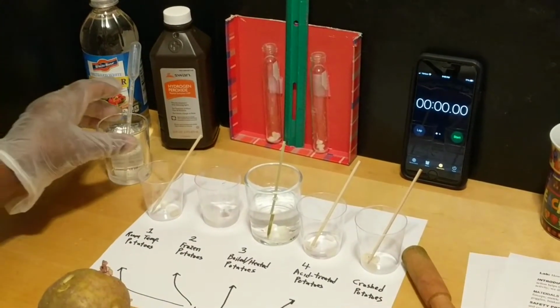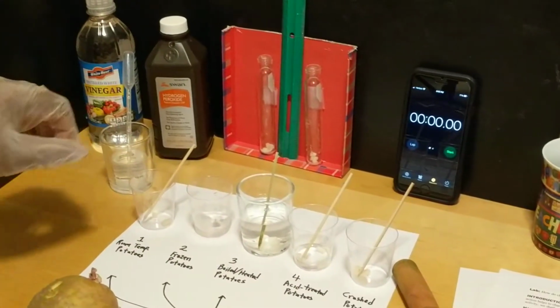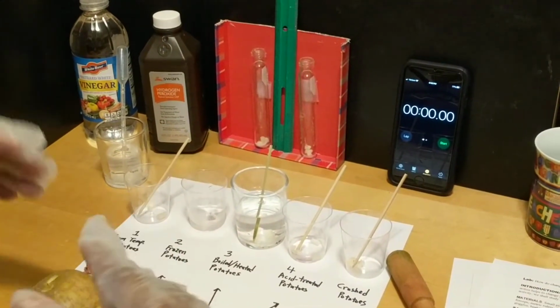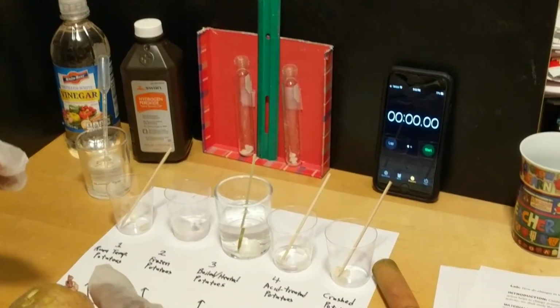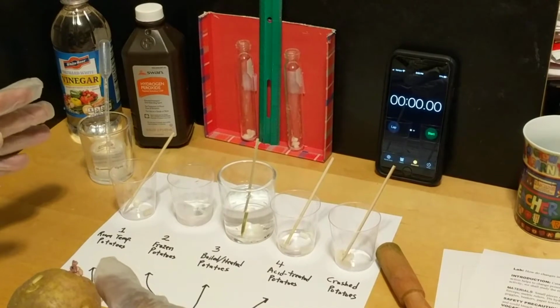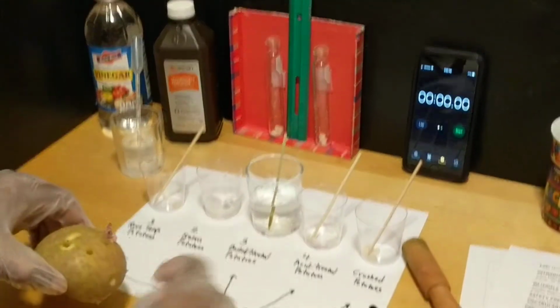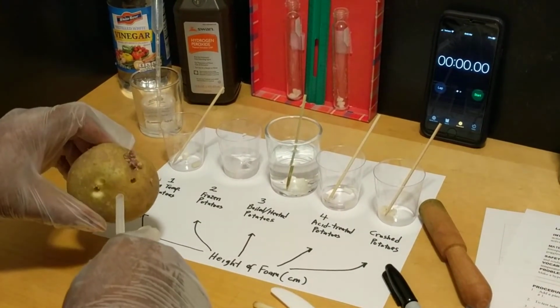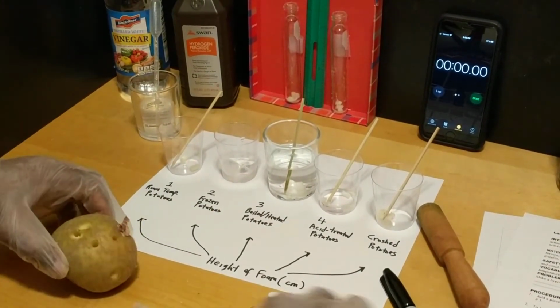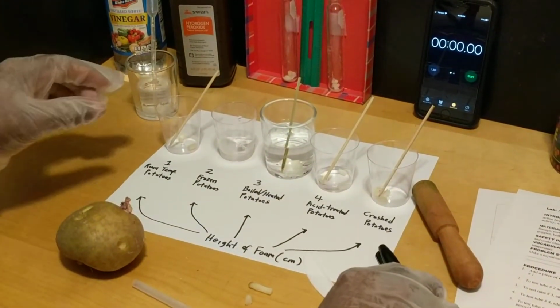We will be using hydrogen peroxide, which you can actually put on a wound, and it has that bubbling sensation because the hydrogen peroxide is broken down by an enzyme in your body called catalase. So catalase is also found in potatoes. So we have extracted a piece of the potatoes by using the straws, getting them out, and we cut them in different pieces and place them in different containers.